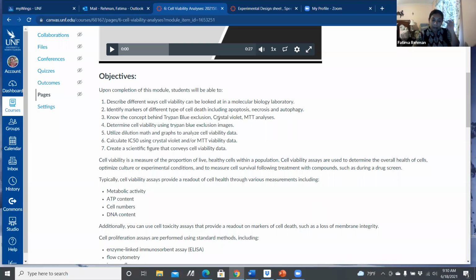Now, a crystal violet growth assay, relative growth assay, or viability assay simply uses the dye as a way to look at how many cells are on your plate or cover slip or dish. So this is different than trypan blue. Here, the blue dye indicates actual cells. So in this case, we usually stain the cell with the crystal violet dye at different time points, starting at the 0 hour, usually going all the way up to 96 hours sometimes.